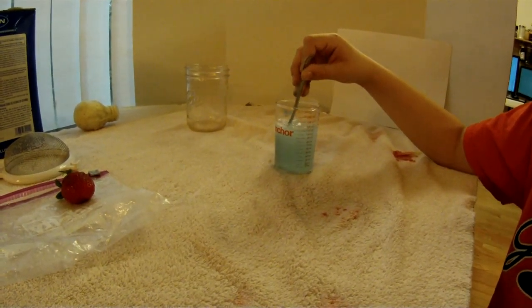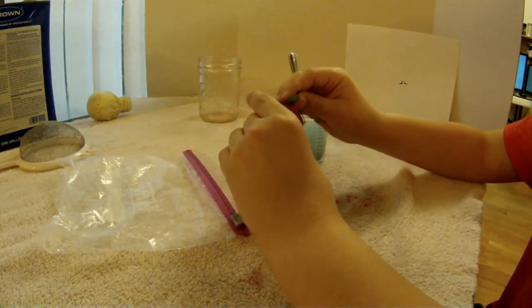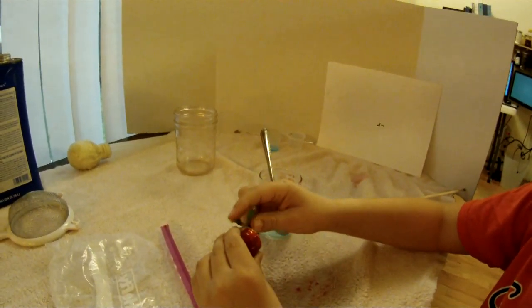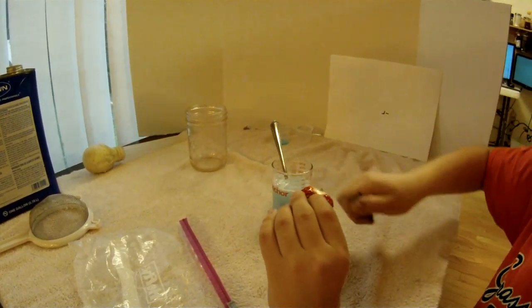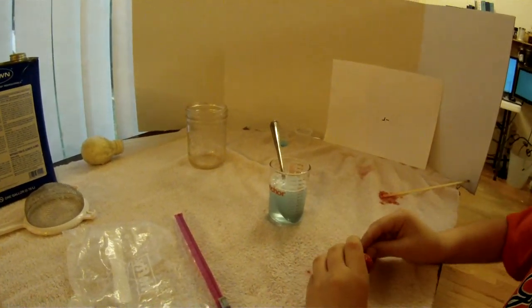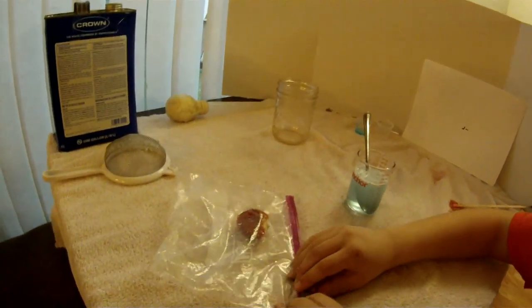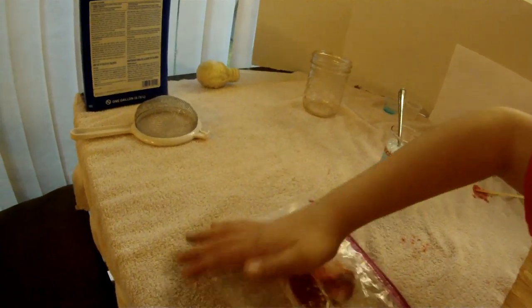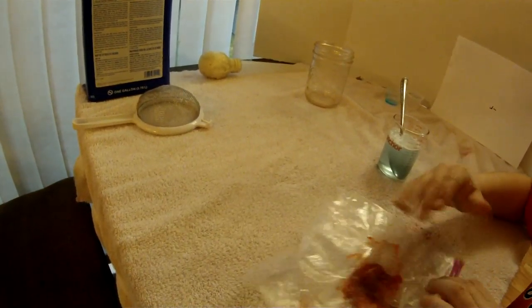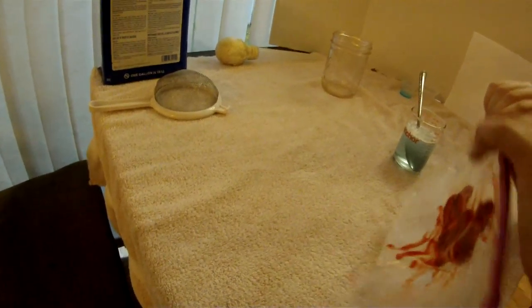We'll take off the stem and then put the strawberry in the bag and we're going to smash it a bit. First you have to make sure all the air is deflated.